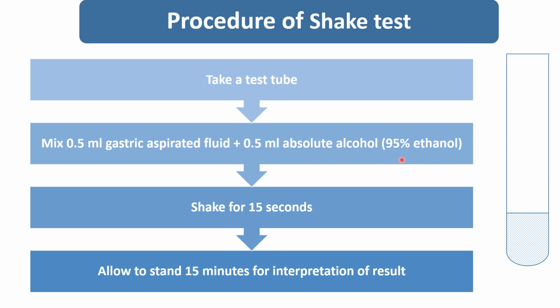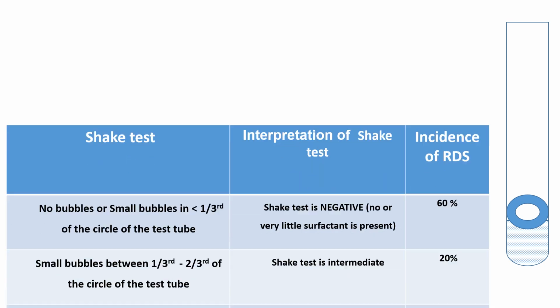It is 95% ethanol. We have to shake it for 15 seconds. Then we have to allow it to stand for 15 minutes for the interpretation of the result. So this is the procedure. Now how will you interpret the shake test?